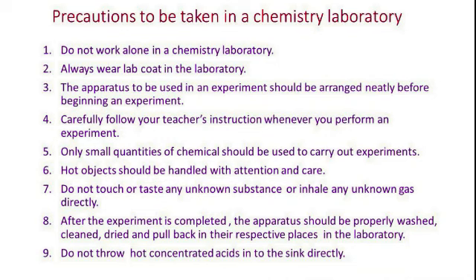The apparatus to be used in an experiment should be arranged neatly before beginning an experiment. And you should follow the teacher's instructions whenever you perform an experiment. The fifth one, only small quantities of chemicals should be used to carry out experiments. Then, hot objects should be handled with attention and care.